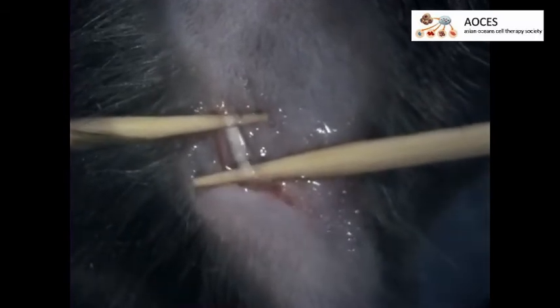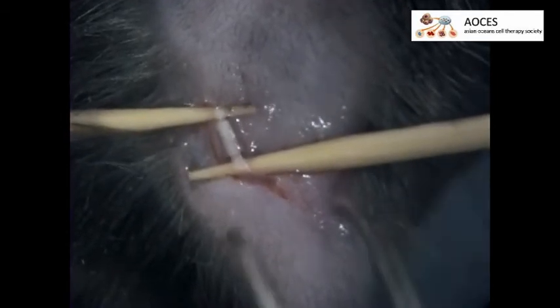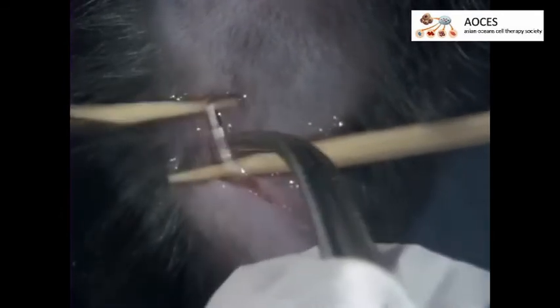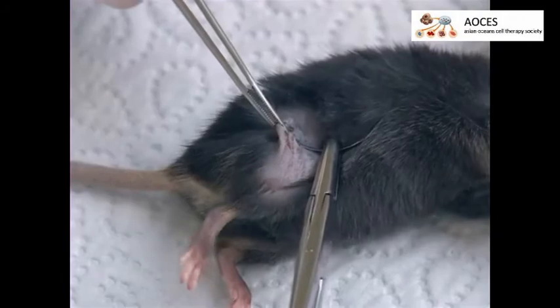Insert the two millimeter cuff around the main branch of the sciatic nerve. Start with inserting the part of the cuff that is distal to the bulldog around the part of the nerve that is proximal to the hip, then close the cuff gently with pliers. To ensure that the cuff is closed correctly, turn it around. Remove the sticks and suture the skin closed using surgical knots.